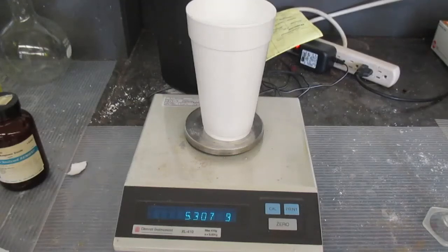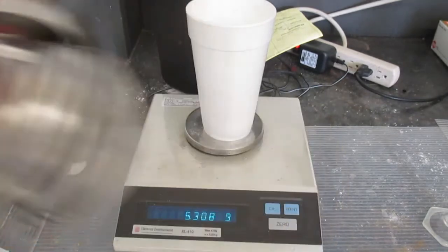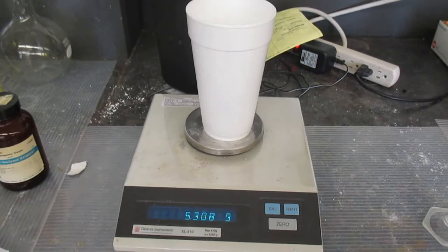In this lab, what we're going to do is determine the standard enthalpy of formation of magnesium oxide. In order to do this, we're going to be using Hess's law. Now, magnesium oxide could be formed very easily from taking strips of magnesium, such as this, and lighting it on fire. But that would be very difficult and dangerous to determine the enthalpy of formation for the magnesium oxide.